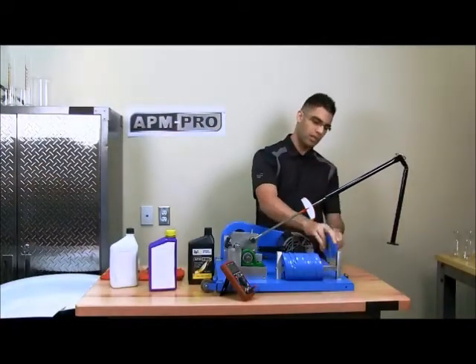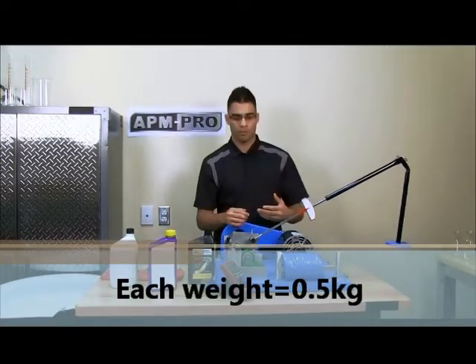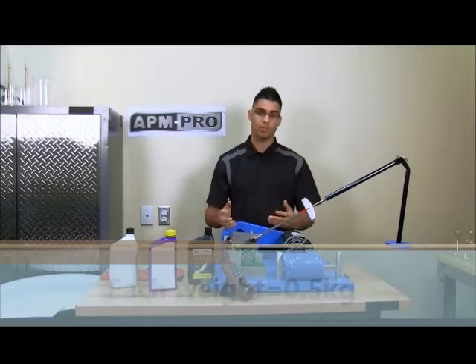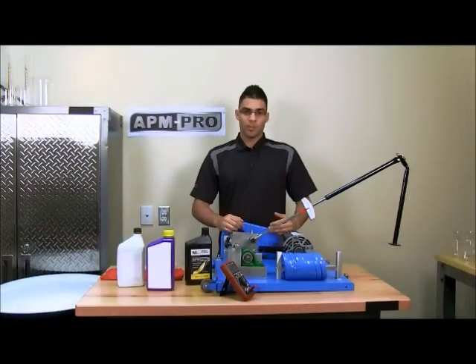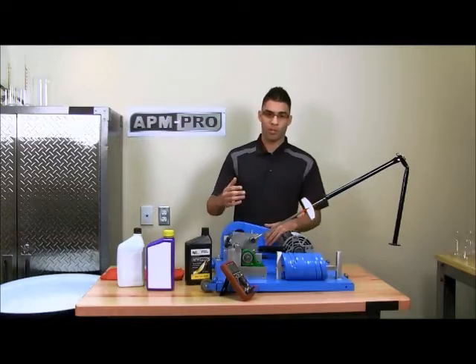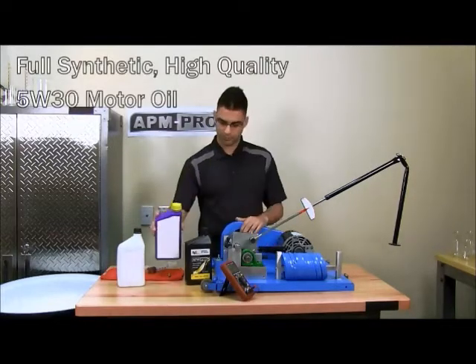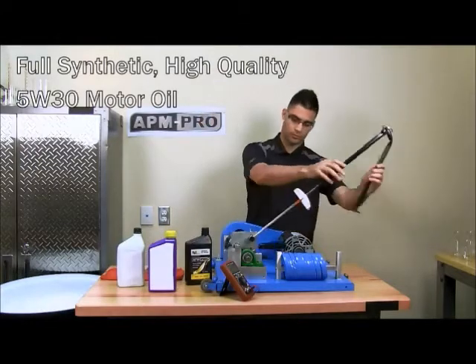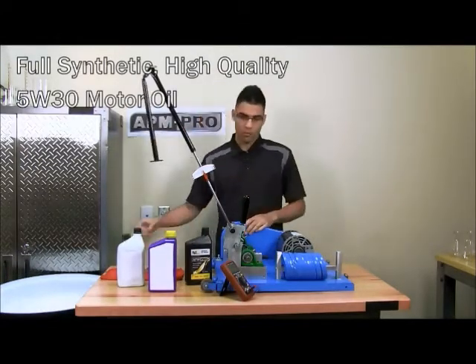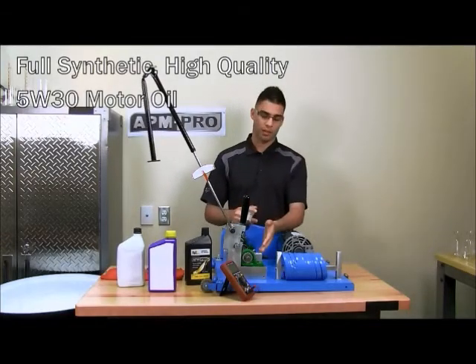We will then be adding one weight at a time acting as loads that will be simulating engines. We will be demonstrating how a fully synthetic high quality motor oil will perform in our machine — we will be using this one over here. We will be placing 15 milliliters of this synthetic oil into the bath.